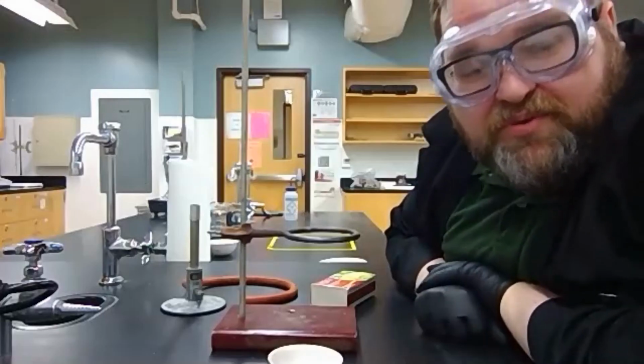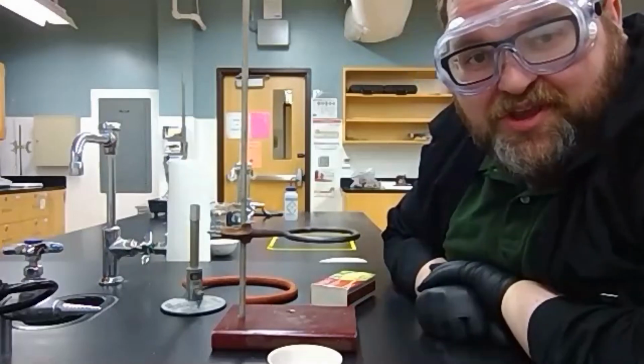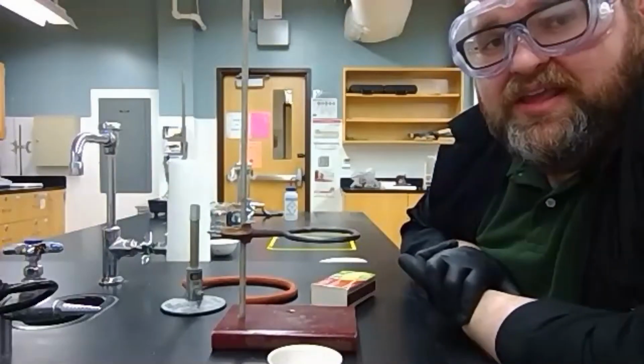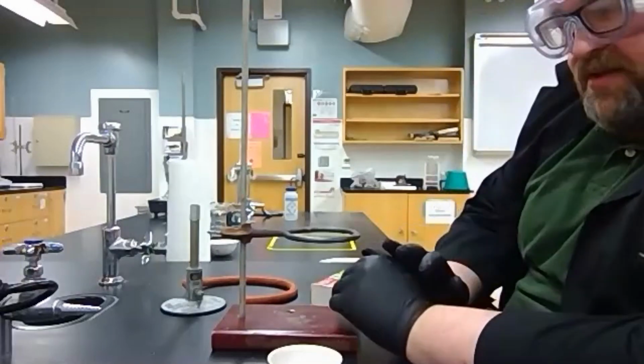Okay, now for those of you who are required to dry your salt down as well, I'm going to show you how to do that. To do that, we need fire. We need something hotter than a hot plate. We need something that's going to really get the heat flowing. So we're going to use a Bunsen burner for this.